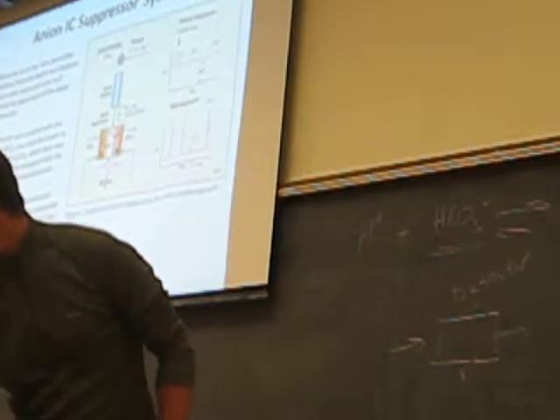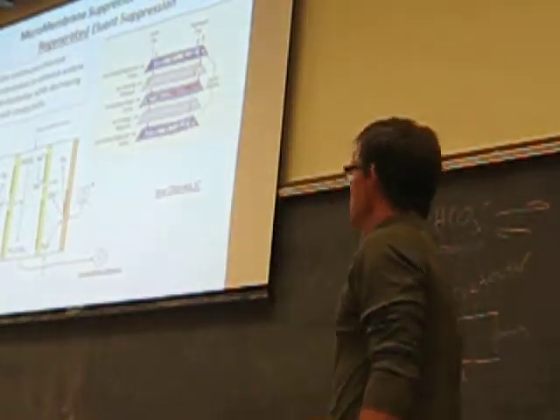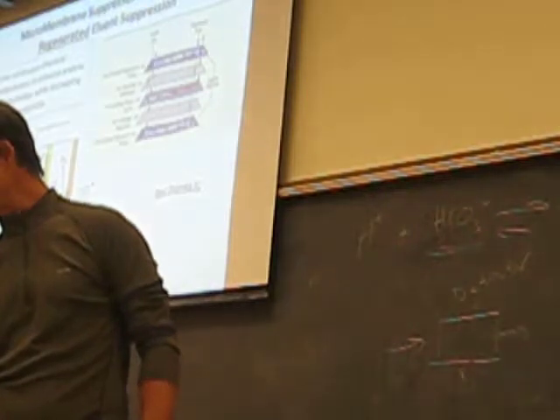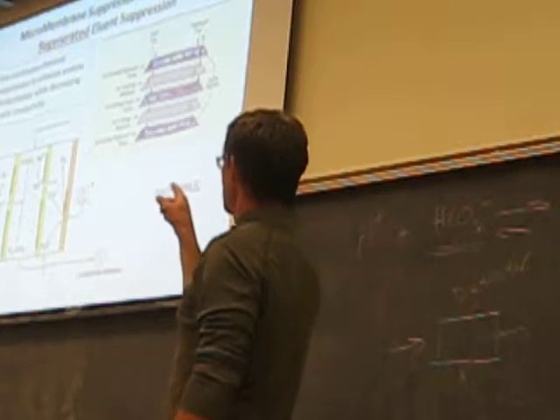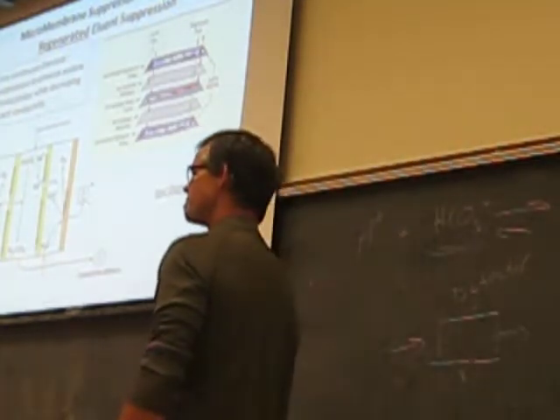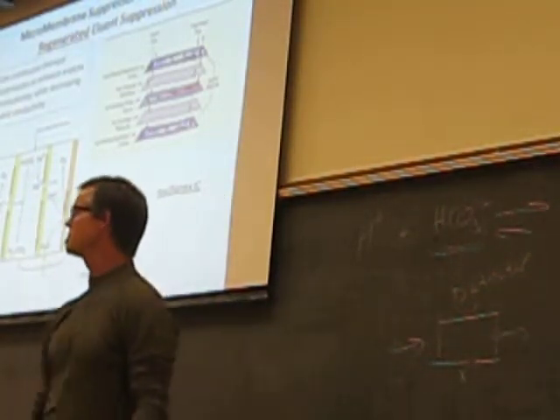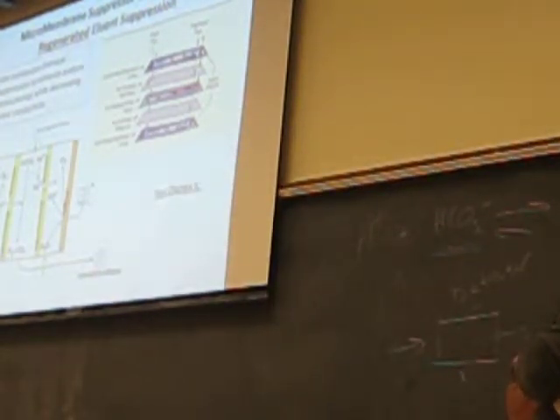So it's a nice bit of chemistry that allows us to increase the sensitivity by at least an order of magnitude in measuring the anions. Right? And it works basically the same way, whether it's a bicarbonate buffer system that you're using, or whether it's a potassium hydroxide, different kind of buffer system. Why does this not remove other anions from the eluent? It's a good question. Why is it not removing other anions from the eluate coming out of the column?